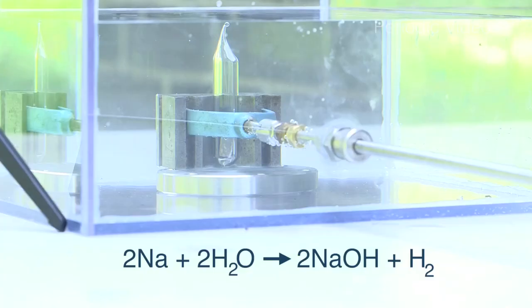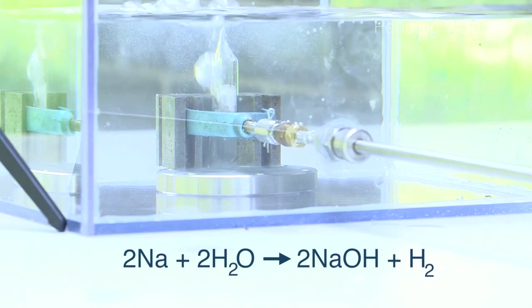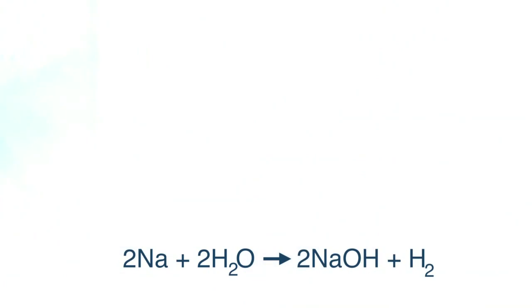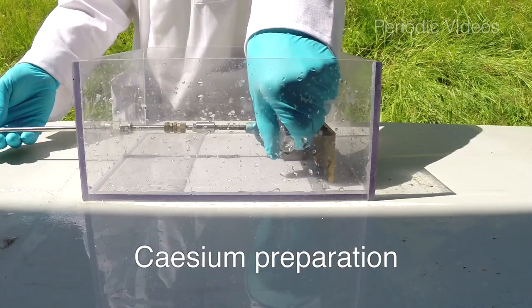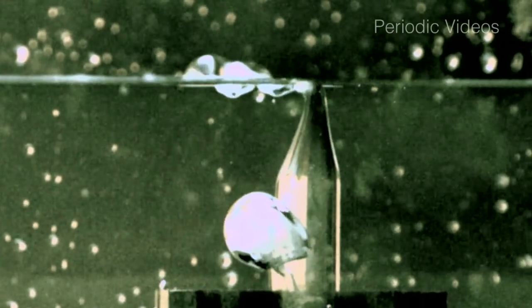When the tube breaks, water rushes in and the reaction starts. The only way that the metal can come into contact with air is if it floats up to the surface. In our caesium tube it was evacuated without any air. In some of the other tubes there was air — in one of our videos the tube wasn't quite properly sealed so it was full of air.